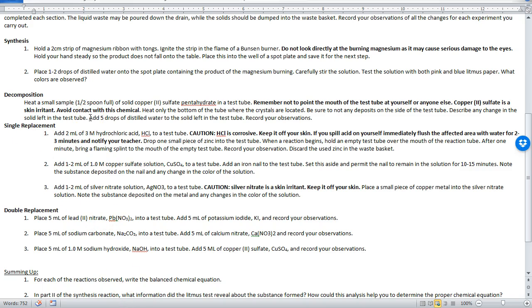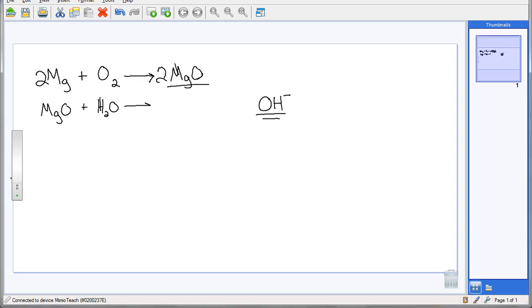And so what it tells us is that you took copper sulfate pentahydrate. Okay, that is a single item. Okay, it is copper sulfate, copper 2 sulfate. Okay, so this is copper with a +2 charge, bonded with a sulfate polyatomic ion, so CuSO4, and it is bonded to pentahydrate.